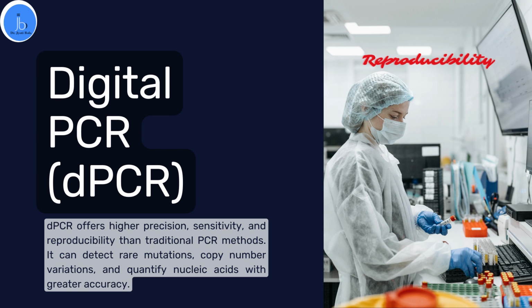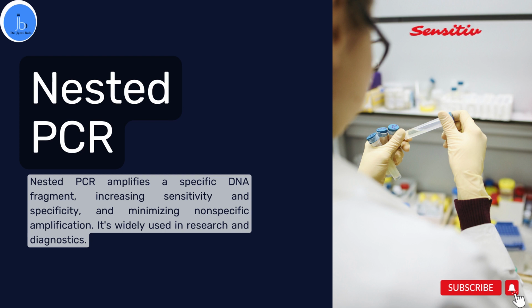Now moving ahead, the next PCR is your nested PCR. Nested PCR amplifies specific DNA fragments and also increases the sensitivity and specificity and minimizes non-specific amplification. Basically, they are used in research and also for diagnostic purposes.